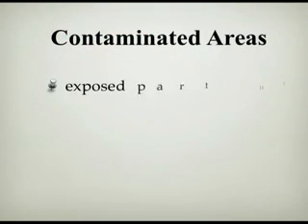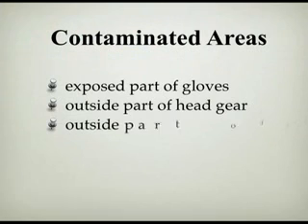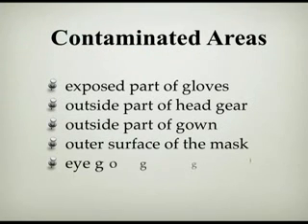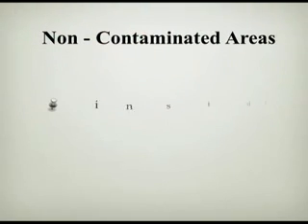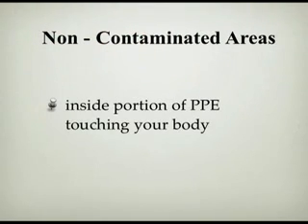While working with PPE, the medical worker should limit contact when it comes to items and surfaces. All PPE items have contaminated and non-contaminated areas, and the wearer should exercise extreme caution. Once the work is done, the PPE items will be contaminated and great care has to be exercised to ensure the proper disposal of the PPE.